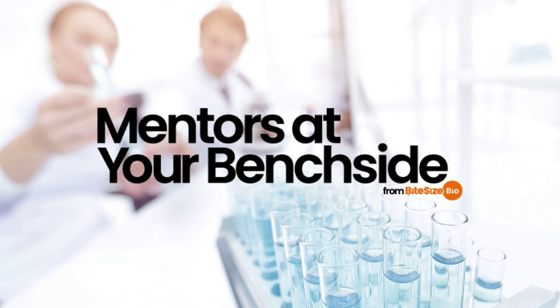Although it's fair to say Cryo-EM is a revolutionary technique at the centre stage of structural biology. As such, it's an opportunity to change old habits. The mere uptake of Cryo-EM is already a feat of behaviour change amongst scientists who, let's face it, can be very set in their ways. Another one must be possible. And there we have it, a short introduction of cryo-electron microscopy.